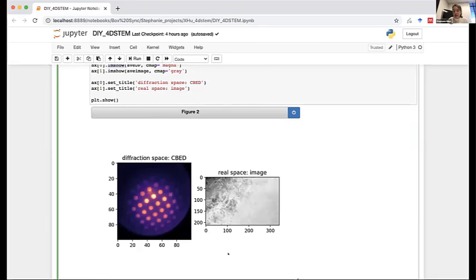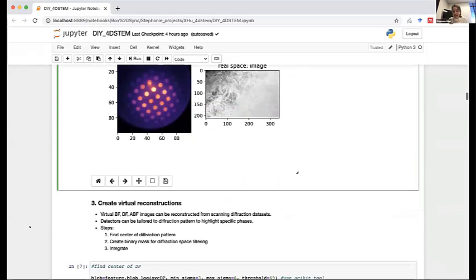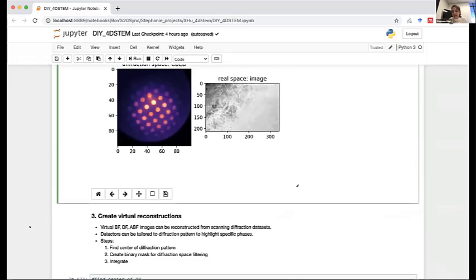So depending on the type of analysis you want to do, and I saw some questions in the chat earlier, you might want to do some other sorts of cleaning or filtering of your data before you do reconstruction. So whether it's getting rid of erroneous signal with a filtering technique or normalizing by vacuum probe to correct for any sort of deflection or inconsistency in your beam, we could do that here, and this would be the place to do it, but it's not where we're going to do it today because we don't need to for this data set. So I'll pause again, Roberto, before I start actually doing the reconstructions to see if there are any more questions that came in.